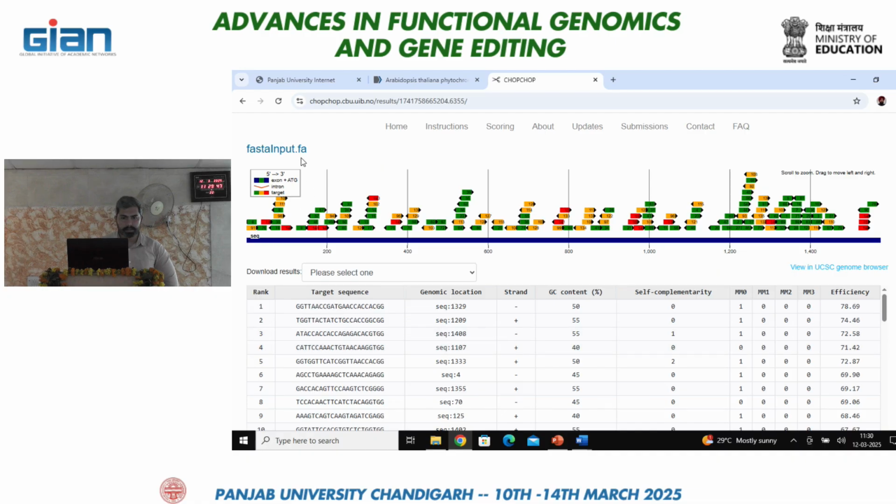And earlier I have also mentioned that this is the scale, and depending on the length and the position of the target, they have been represented here in this section. Okay. Sir, even his self-complementarity should be 0. Yes, these are also some parameters which you need to look for.